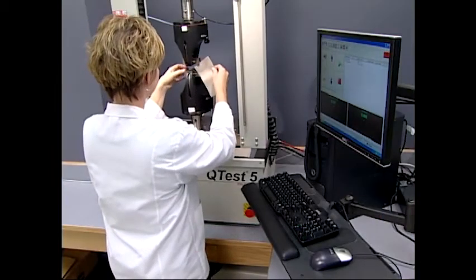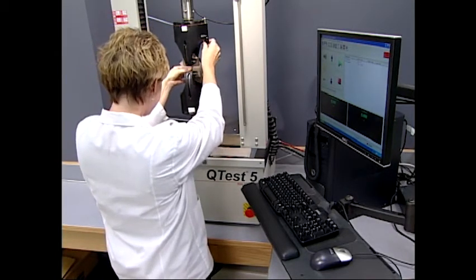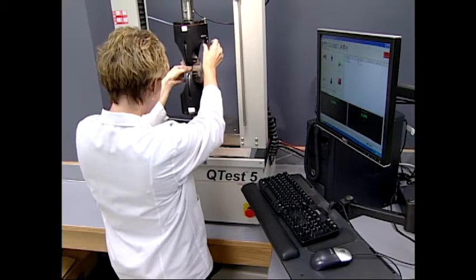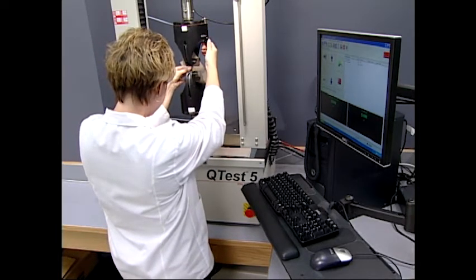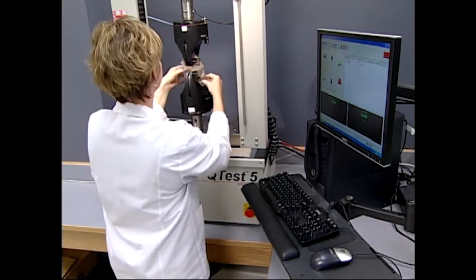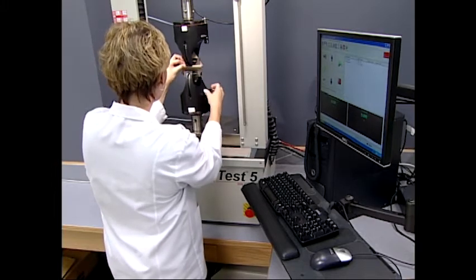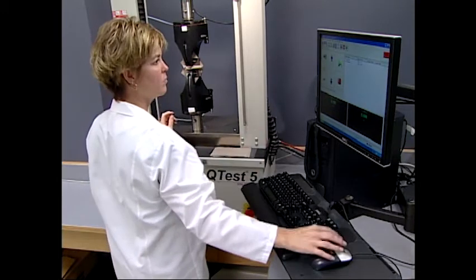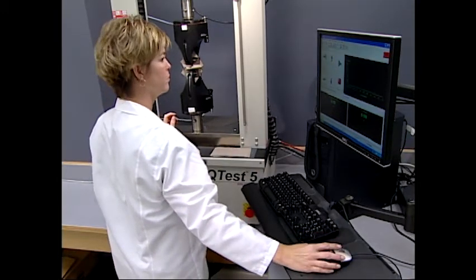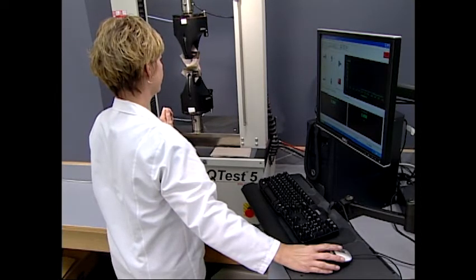Tearing strength is the resistance of a material to start and/or propagate a tear. Different test methods are applicable to most woven fabrics, including blankets, napped fabrics, pile fabrics, airbags, and many other constructions. Some warp knits can be tested in the warpwise direction only. Tear strength relates directly to the strength of the individual yarns in the fabric. As the tearing force increases, the yarns distort until they rupture. In essence, they're sheared by the yarns perpendicular to their fabric direction.